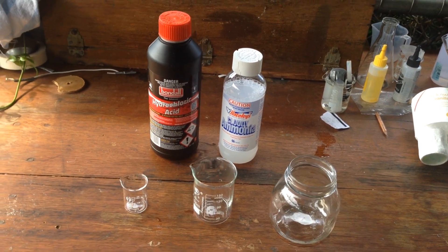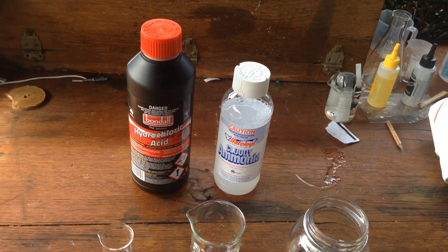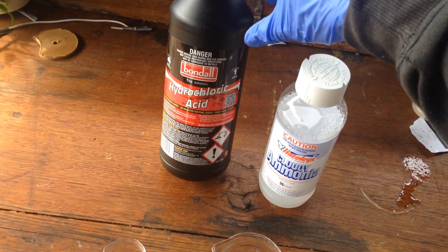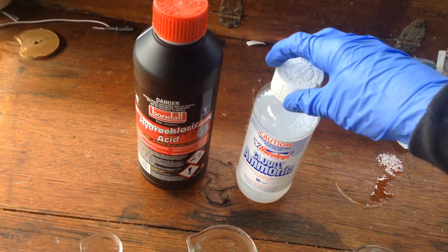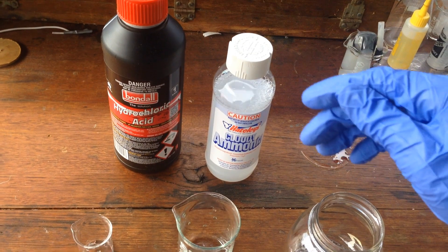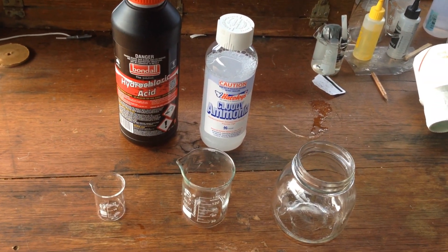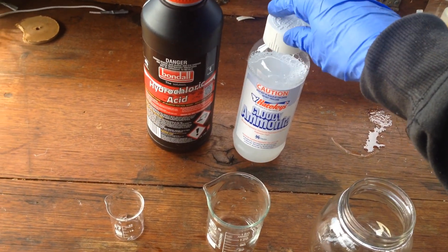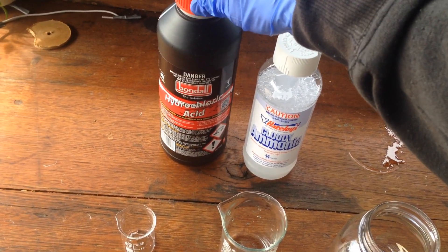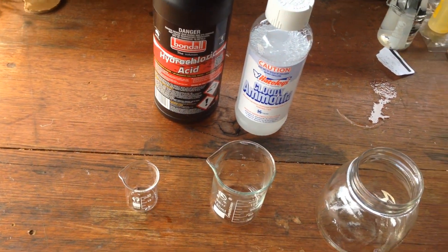It's probably going to be a pretty simple short video today. All we're going to do is react hydrochloric acid and some ammonia to generate some ammonium chloride. From the concentrations I've got here — 32% hydrochloric acid and just a little bit over 1% ammonia — in order to generate around 5 grams of ammonium chloride, we'll need around 145 milliliters of this 1.1% ammonia and a little bit over 10 milliliters of this hydrochloric acid. I've got these beakers here ready to set that up.